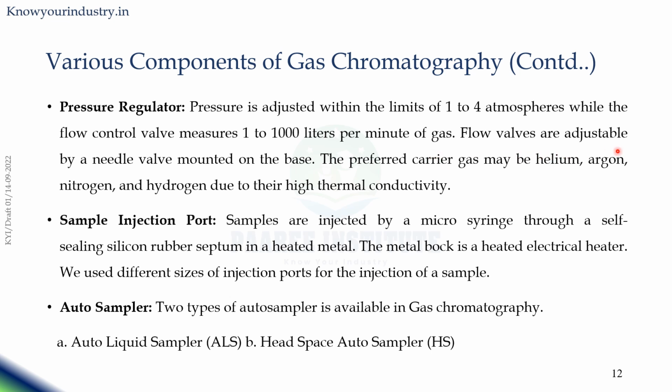The flow valves are adjustable by a needle valve mounted on the base. The preferred carrier gas may be helium, argon, nitrogen and hydrogen due to their high thermal conductivity.